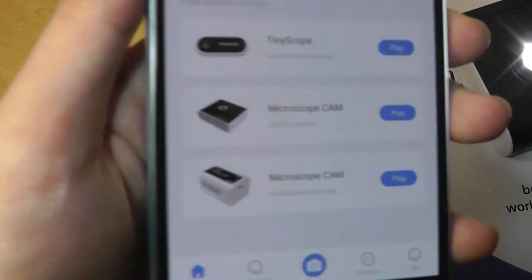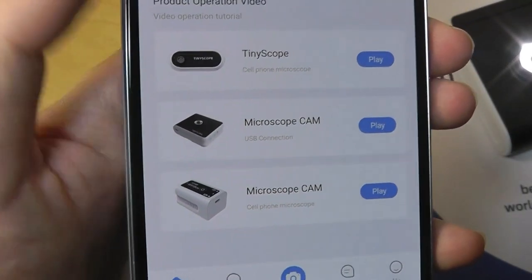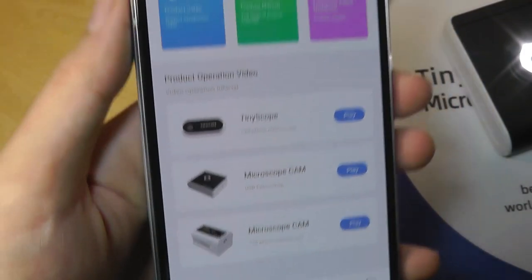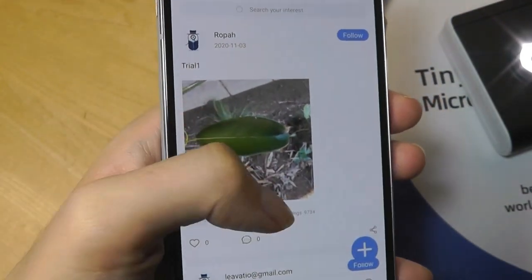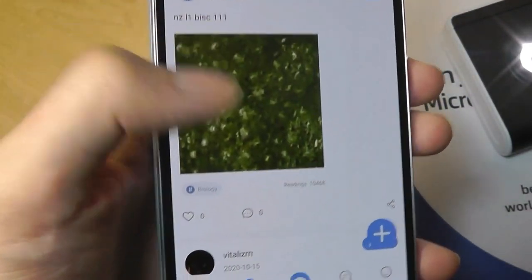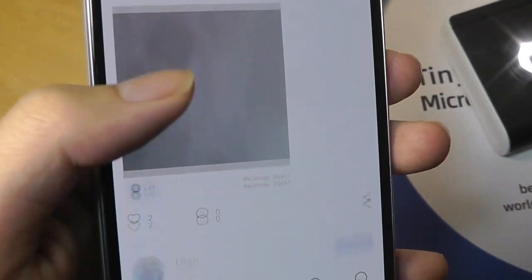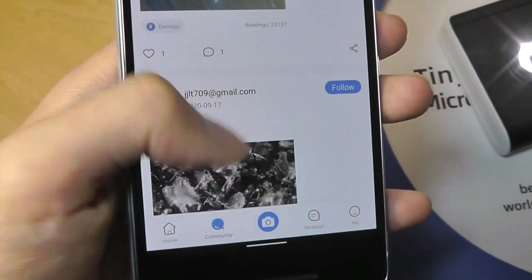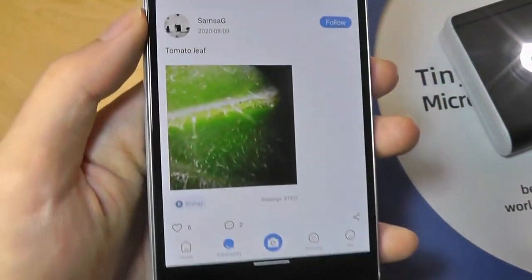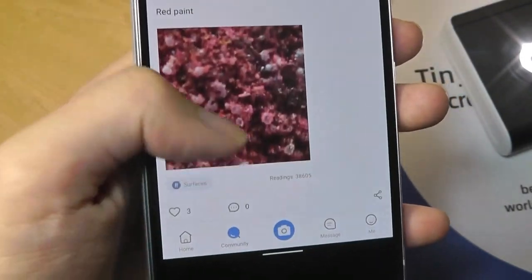It goes all the way up to 4K, which is pretty good. They've released a few different models, and when you first plug it in you can go into the homepage to play back tutorials on how to link it up, and also take a look at a community where people have uploaded different samples of objects and shared them onto the platform — things like genes, a different mouse pad — which is actually kind of fun and interactive and more engaging than I was expecting. They're really trying to make this microscopic exploration theme more fun, and there are users genuinely sharing their images, which is interesting to observe.